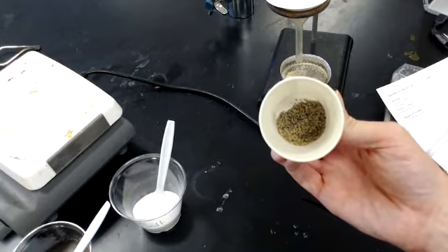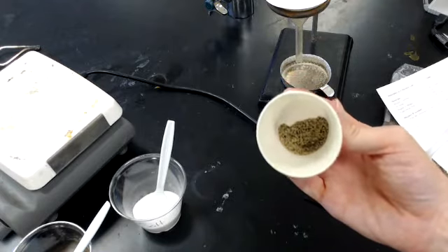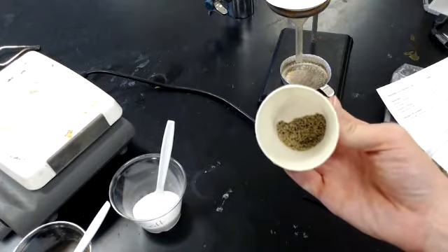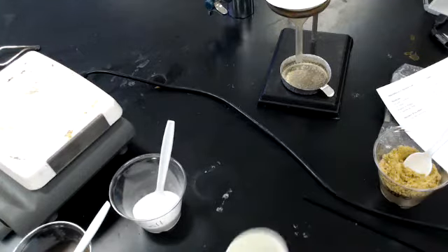Tell me if anything changed with the physical properties. Tell me what kind of change this is, that sort of thing. Be filling out your lab. Okay, now I'm going to start separating it. So I have a mixture, and I'm going to start separating it.